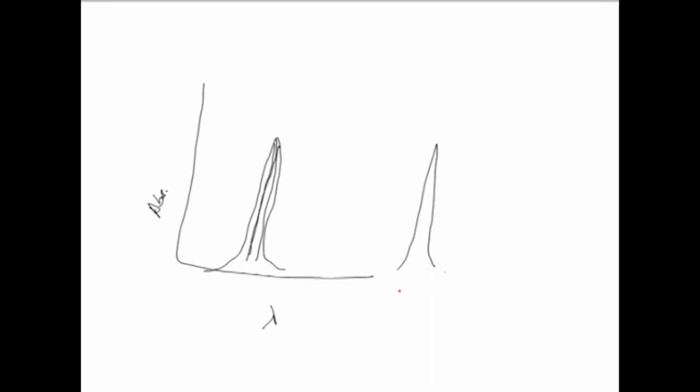So, that has to be understood, that as we were talking about Beer's law, one is concentration: if it is too high, then also it will be violated. Then it has to be done at the proper wavelength, so that Beer's law holds, and a lot of other precautions have to be taken, so that this particular analysis could be done without any problems or without any spurious results actually.